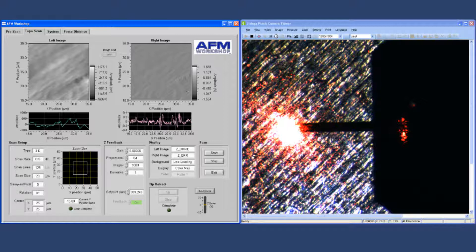Finally, there are capabilities for centering the scan and the Z axis and retracting the tip.